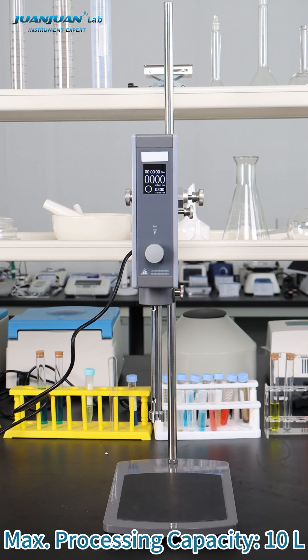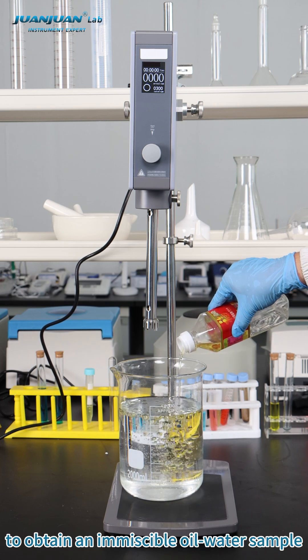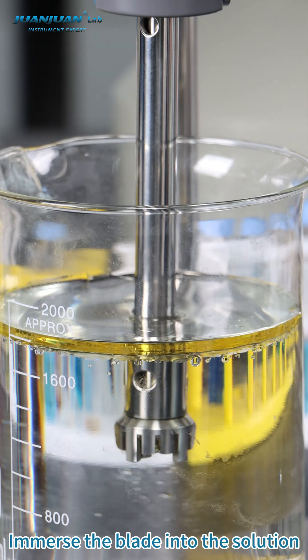Turn on the power. Max processing capacity: 10 liters. To obtain an immiscible oil-water sample, immerse the blade into the solution.